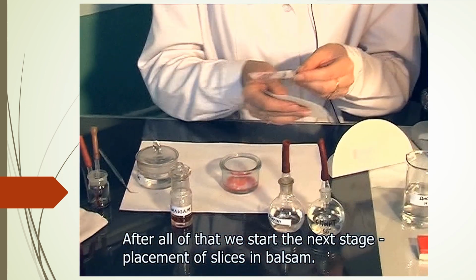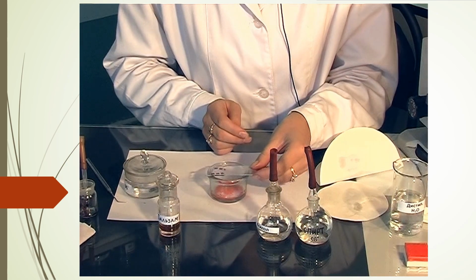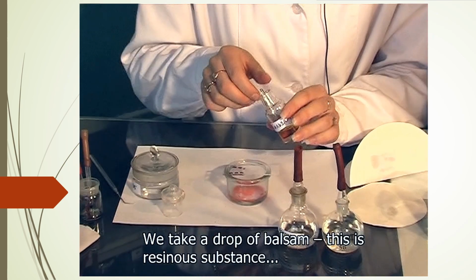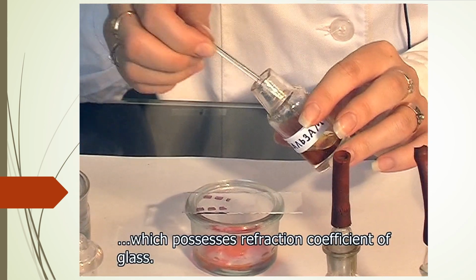After all of that, we start the next stage of placement of slices in balsam. We take a drop of Canadian balsam. This is a resinous substance, which possesses the refraction coefficient of glass.